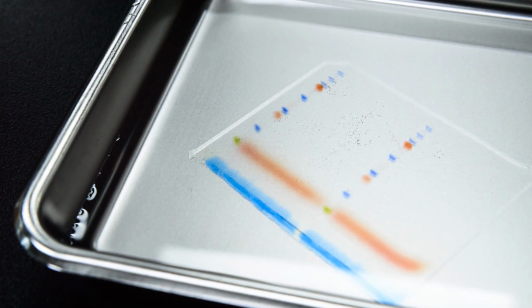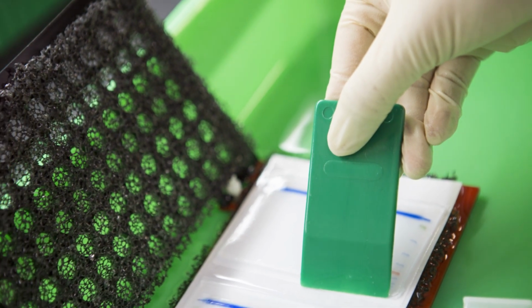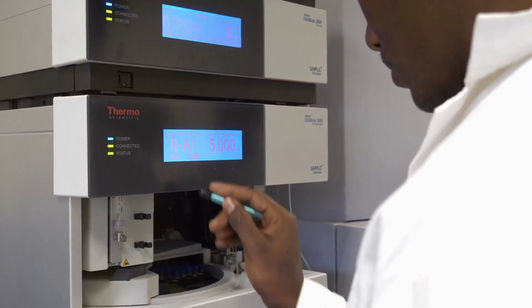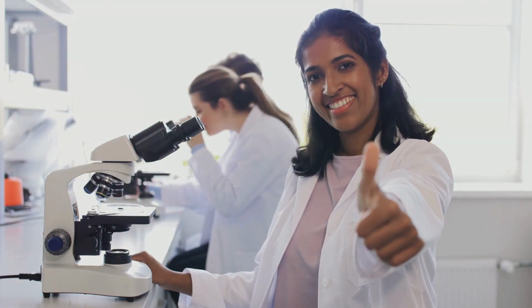Validate. Run SDS-PAGE and Western blot for yield and purity. Check for activity with a functional assay. Test stability by storing an aliquot at 4 degrees C overnight. For structural work, check micelle size by size exclusion chromatography. If all checks out, you've nailed your detergent choice. On to the next experiment.